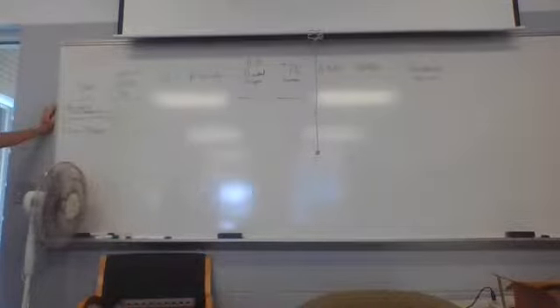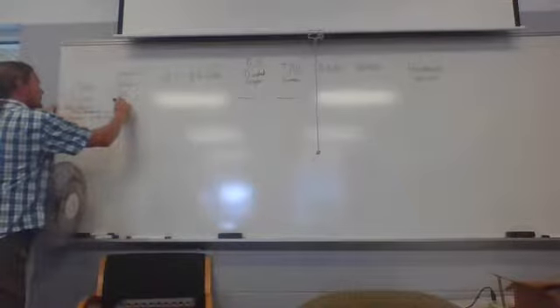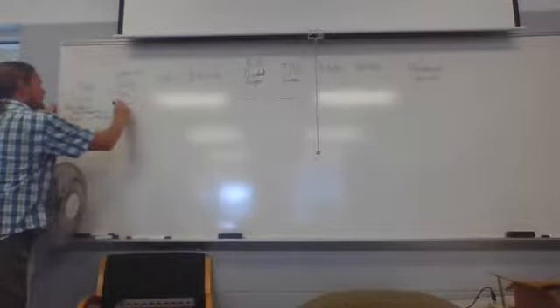Salinity, okay. So this has a demineralizer in it and a titration reagent A, B. I wouldn't recommend using this. It looks like it's seen better days. So it's got multiple reagents.